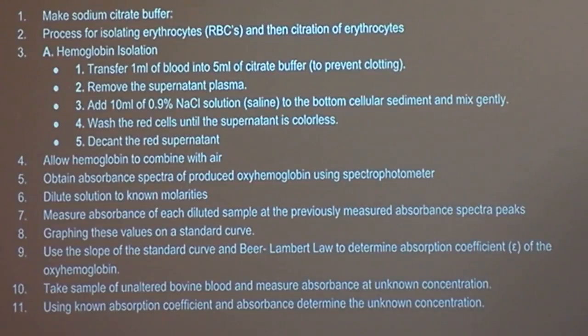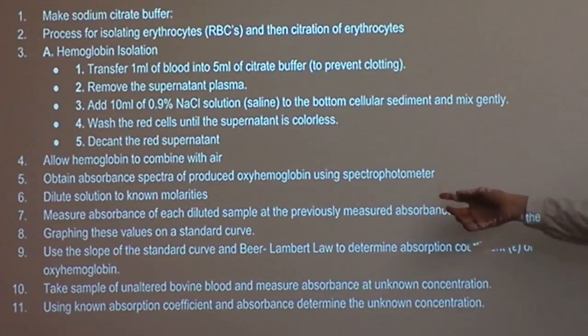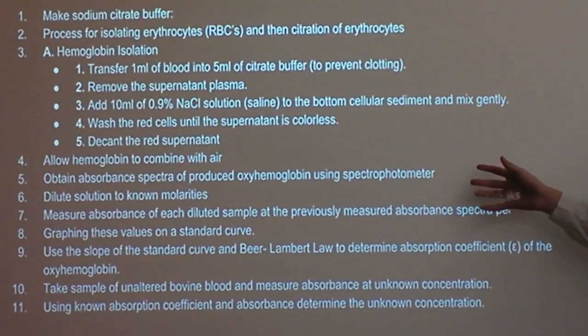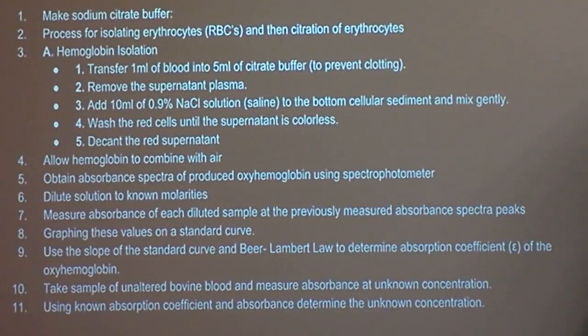You had to allow the hemoglobin to combine with air because that gave us the oxyhemoglobin complexes. And then this, from 5 down, describes our procedure for performing the experiment to find the concentrations and the absorbance spectra of the oxyhemoglobin.